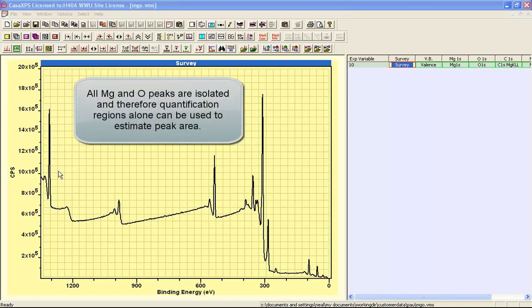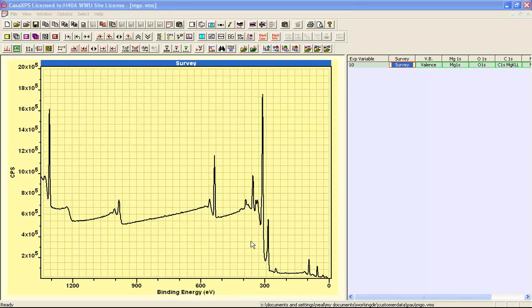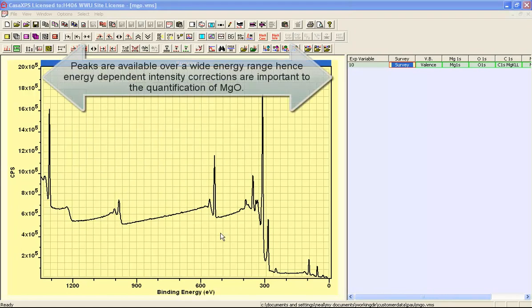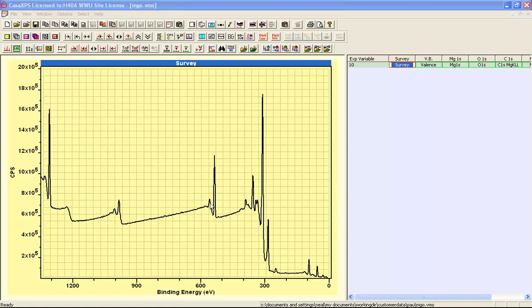What is more, the magnesium peaks are either at very low kinetic energy or very high kinetic energy, and the oxygen peaks sit somewhere in the middle. So any variation in signal intensity as a consequence of change in kinetic energy for the photoemission electrons will be easily observed by any quantification procedures that we apply to these data.